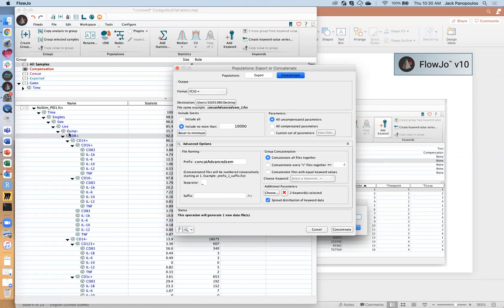It's going to be the same as what you derive on the raw data. The difference here is that the scale space matters when it comes to, it's as if the algorithms had eyes. Imagine, it's a lot easier to see two populations that are spread apart with a lot of space in between them versus two populations that are sort of crammed together.